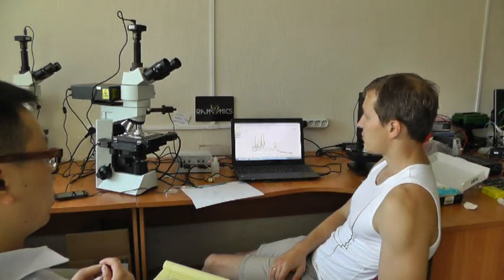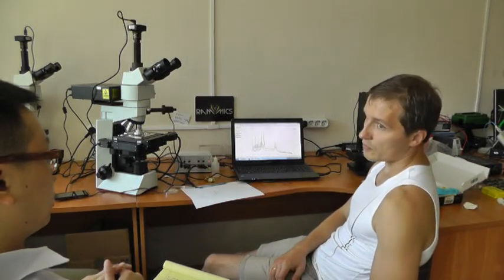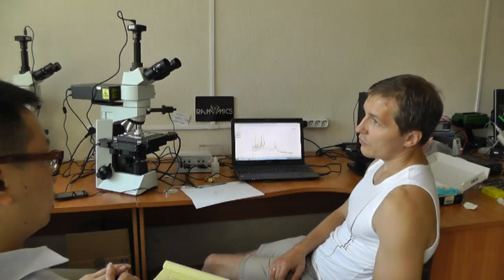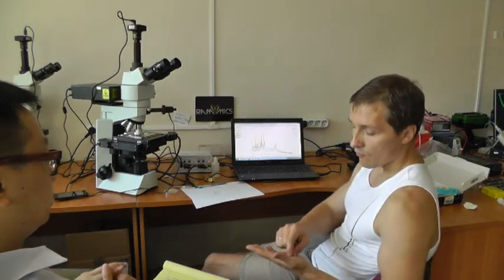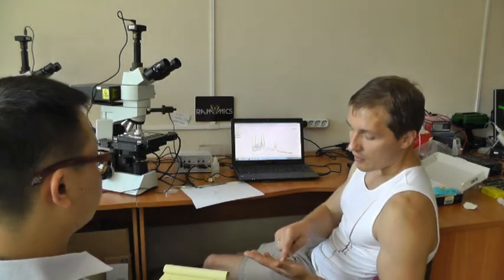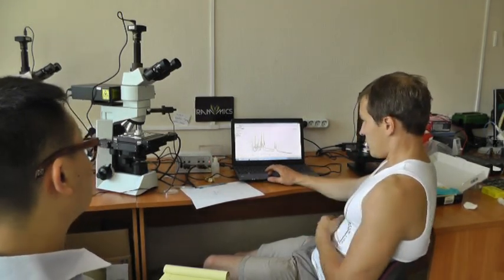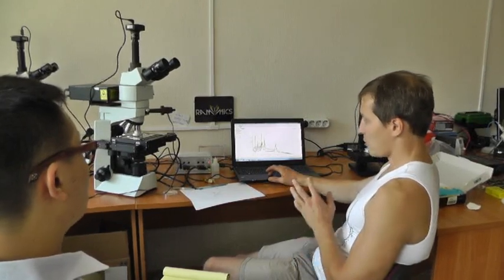For recognizing of powders, it could be set by default to say 15 microns. It is enough to move from one particle to the neighboring one, but it should not be smaller than 5 microns, because average particle size is 5 to 10 microns. And that's why this parameter is still present in the software.